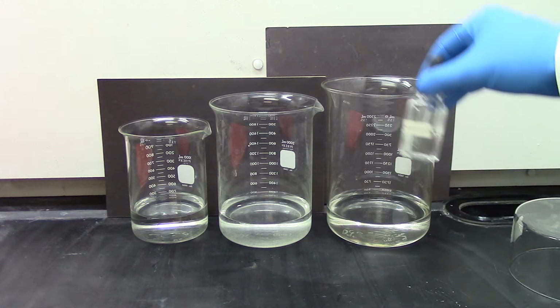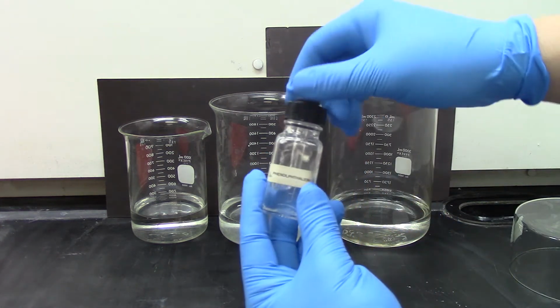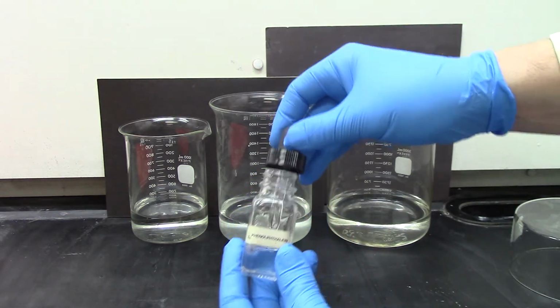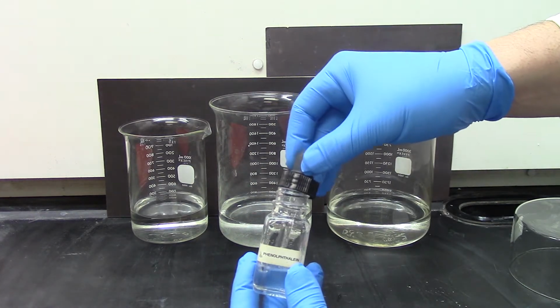To show that this reaction produces hydroxides as a product, I'm adding a little bit of phenolphthalein to each of these beakers. Phenolphthalein is a pH indicator that turns pink in basic solutions when the pH is higher than 7.